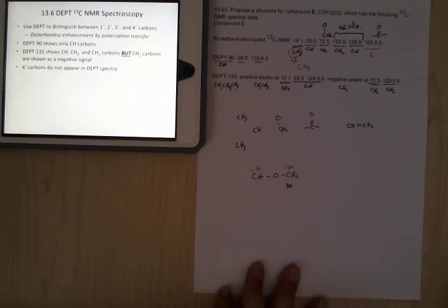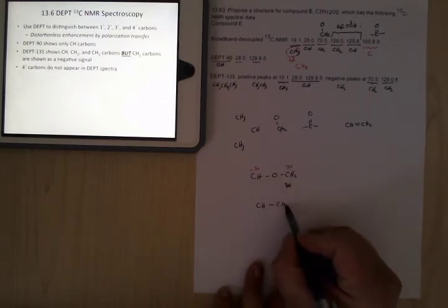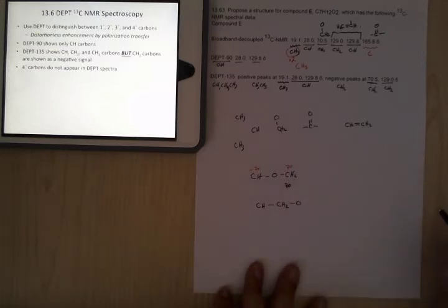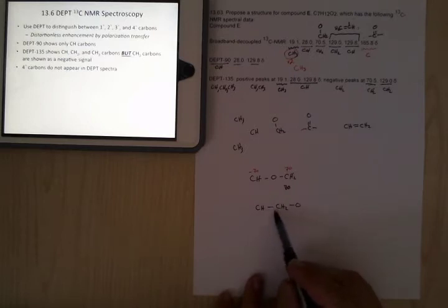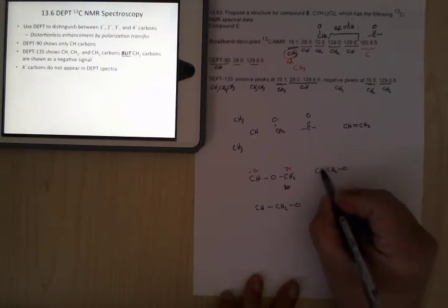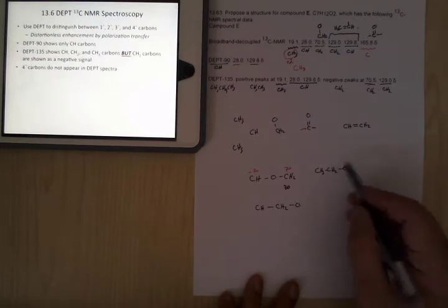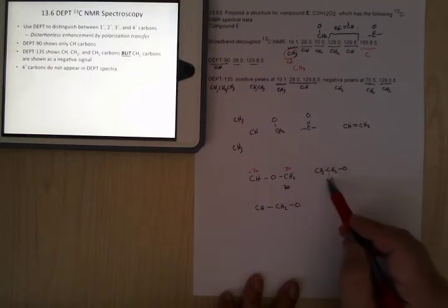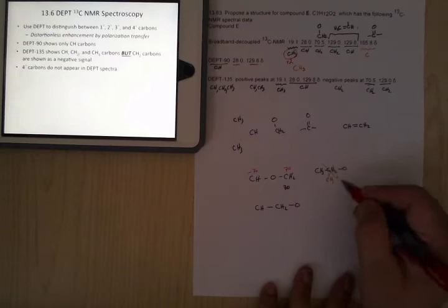But it could be, say, connected like this. Now this would be normal, it's just right to another carbon, an oxygen. Another thing you could do is say, well, what if it's CH2O, let's say it's one of those CH3s. Well, we can't do that, because this carbon needs another CH3 hanging off of there to make these two equivalent as they're spinning around. So it can't be that.